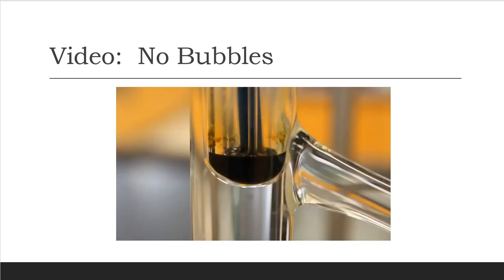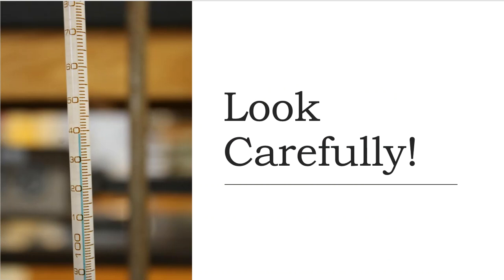Okay, so we're about done with boiling point, but before I finish, I've got to show you the thermometer. Here it is. I'm going to let you read the thermometer on your own. Keep in mind, we are not covering the bulb. We are nowhere near the immersion line. And right here is the 100 mark. So 10, 20, 30, 40, that's actually 110, 120, 130, 140, 150, 160, 170. I'll let you read that boiling point the way that you want to. But once more, keep in mind that this could be skewed, and the higher we go up on the thermometer, the more it will be skewed.